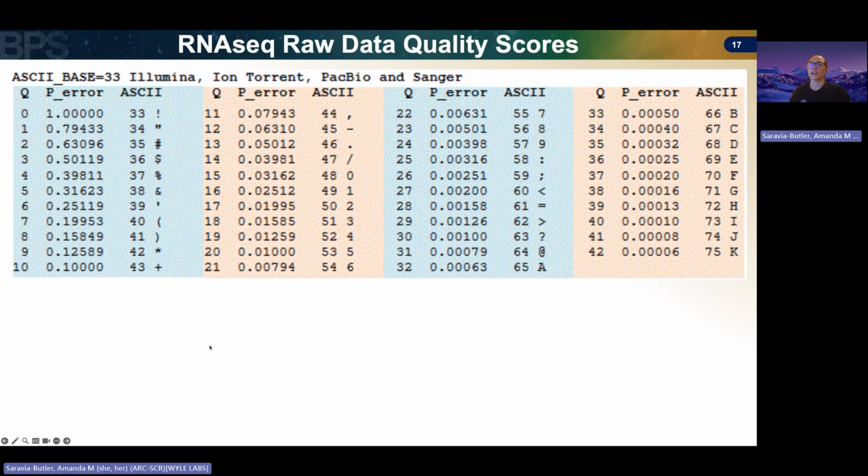So this is looking here at the ASCII base 33 mapping for the quality of each nucleotide call in the sequence.